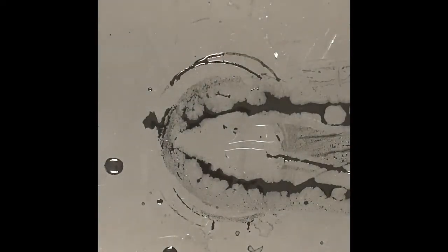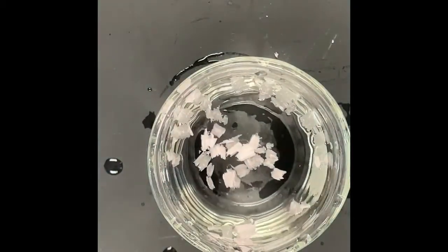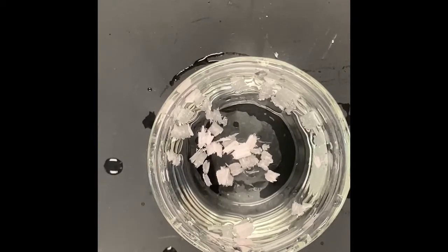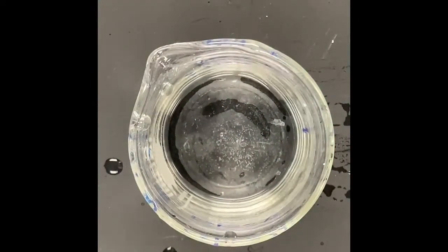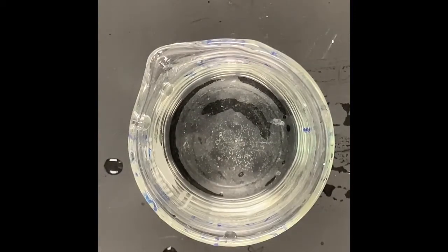I believe next is our wax. Here's what the wax looks like. That is our paraffin wax. From the wax, we have sodium chloride. And last but not least, sucrose.